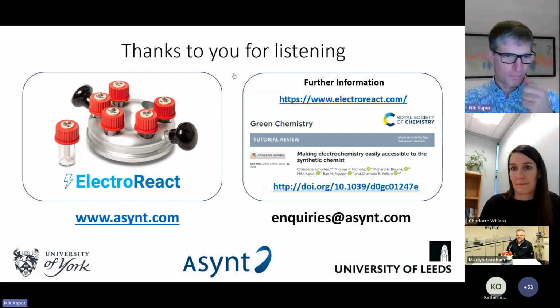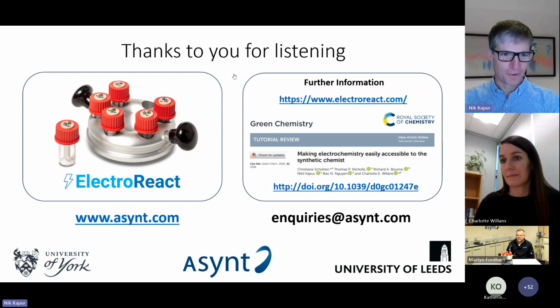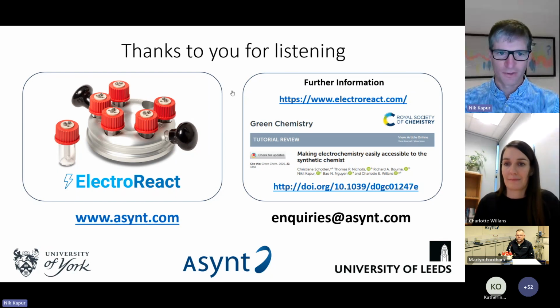I can perhaps answer from an electronic perspective. The power packs would typically be a maximum voltage of 30 volts DC. That's not high enough to cause significant risk of electrocution. I'm not going to say no risk of electrocution, but it's the sort of power pack we would use all the time in undergraduate teaching labs without any real concerns or risks. And Charlotte, I guess there are typical voltages you would use in these reactions.